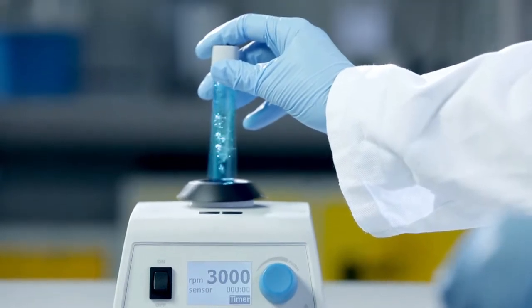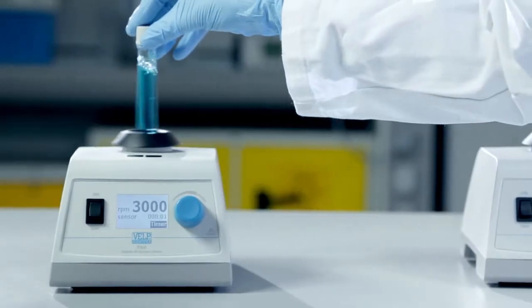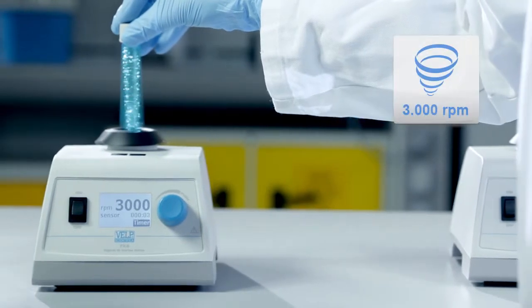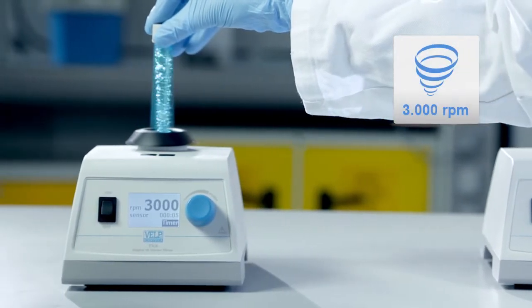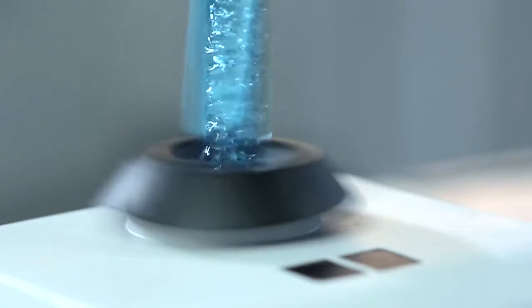Lower speed settings allow for gentle mixing, whilst control ramping and high speeds ensure vigorous vortex mixing while remaining stable.